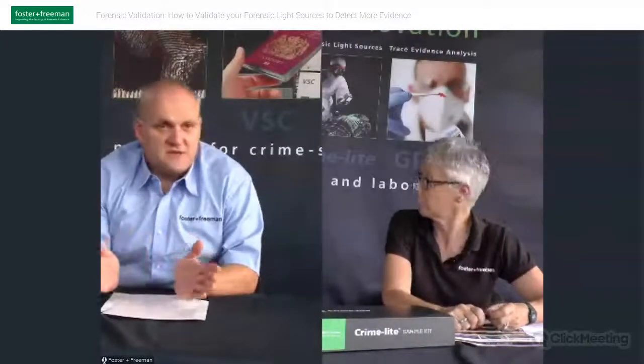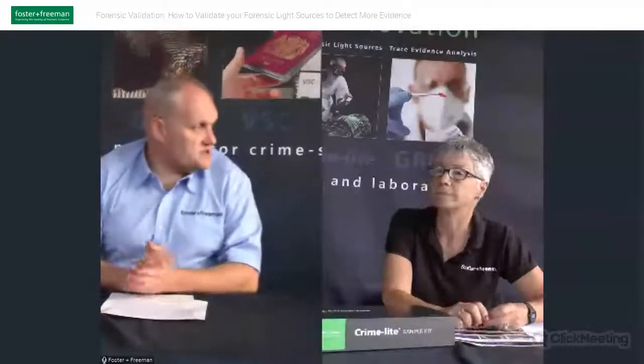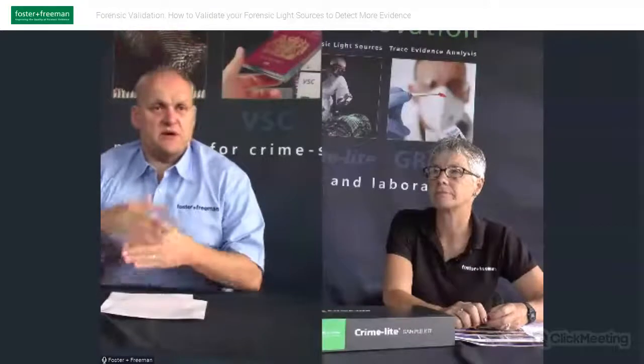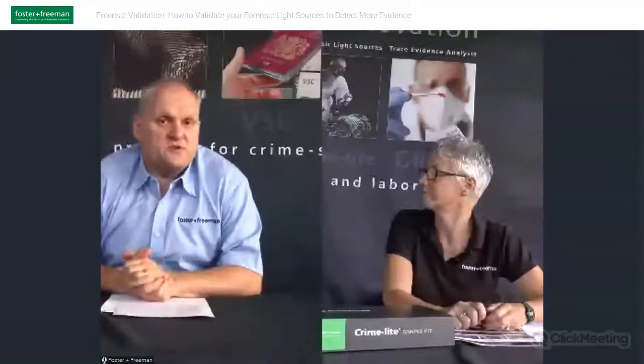If I can just add a bit to that as well, Yvonne. When we sell the Crime-lites, every Crime-lite comes with a certificate of calibration from the factory. We measure the wavelength output and the intensity, and you get a certificate of that. Then, over time, many of the ISO 17025 regulations insist that we retest that light source to make sure it is operating as expected. So as Yvonne says, you could send them here, but some of our distributors around the world also offer this facility. It may well be that there are distributors in your country that can offer local recalibration or retesting services for your light sources.